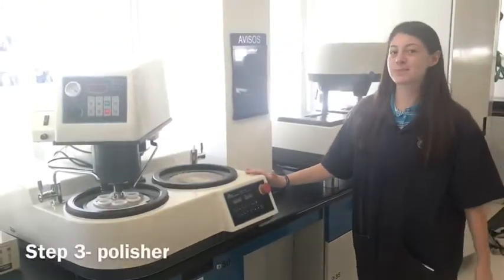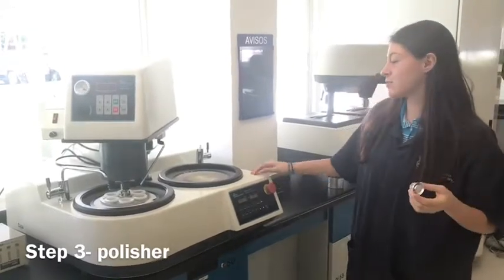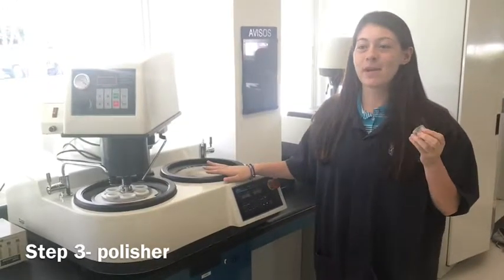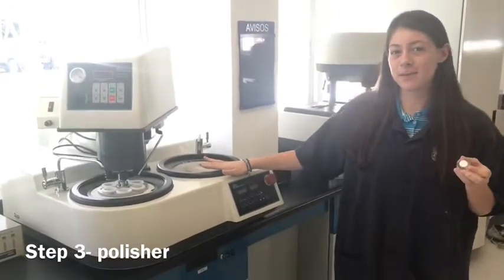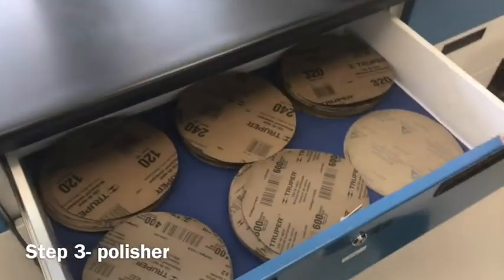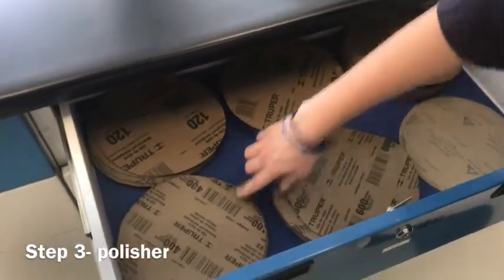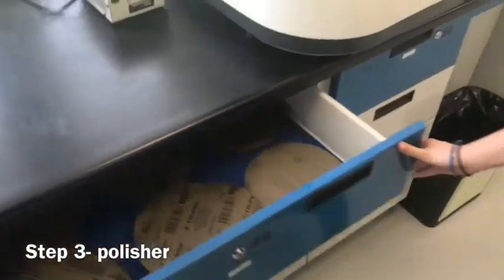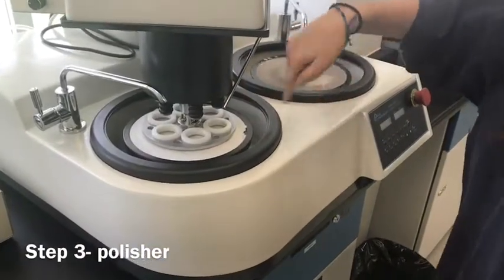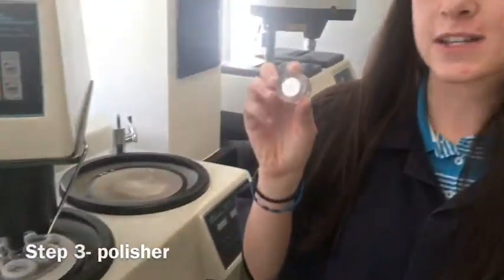This is a grinder polisher machine, and here we are going to sand our samples. Depending on which material we are going to sand, it may take different amounts of time. In this machine, we are going to use these sandpapers: 240, 320, 400 and 600. What you have to do is put your sample here, and this machine is going to spin, so you can get a mirror-like effect on it.